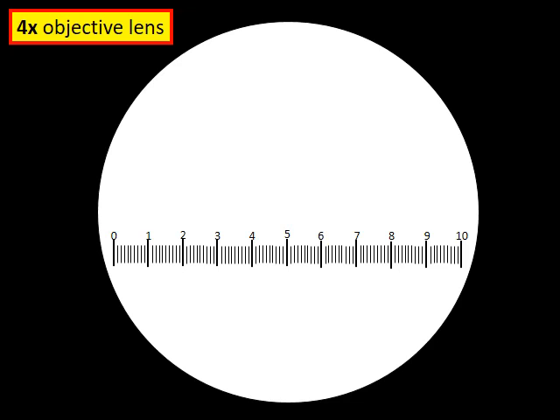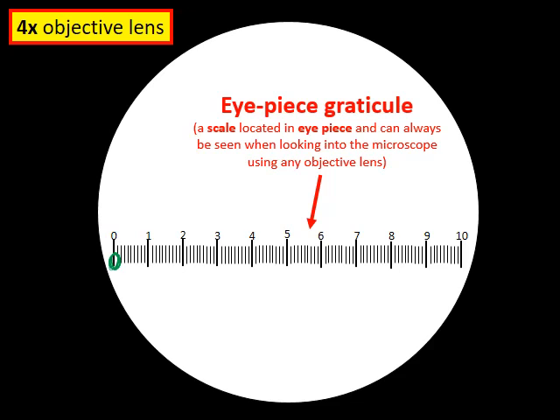Before placing any slide on the stage, if we look down the microscope we will see the eyepiece graticule. The scale runs from 0 to 10, but is divided into 100 small units. We are interested in these small divisions — each one is one eyepiece graticule unit. There are 100 small units in total, and we want to work out what a single tiny eyepiece graticule unit is actually worth.